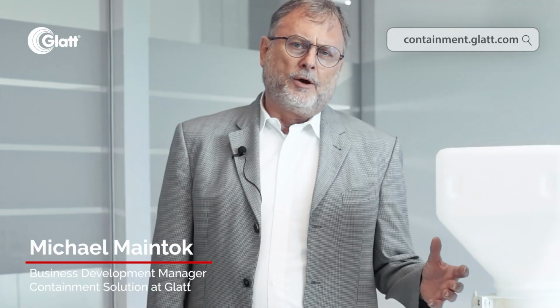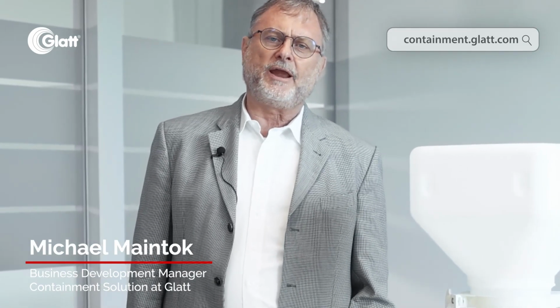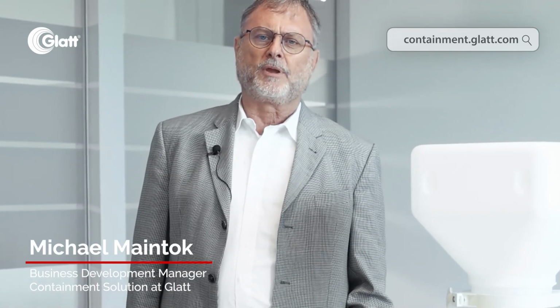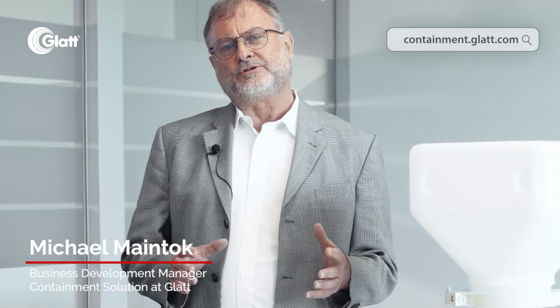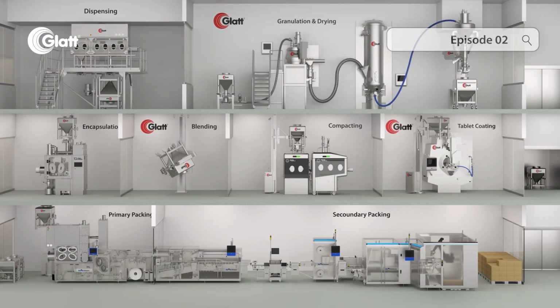What are the critical interfaces in the pharmaceutical production of OSD products? We take a look at a simple pharmaceutical facility in which highly active products are processed. Where does special attention need to be paid in order to avoid cross-contamination or the endangering of the personnel? How do we avoid the medication of our operators? Let's have a look at our production facility.